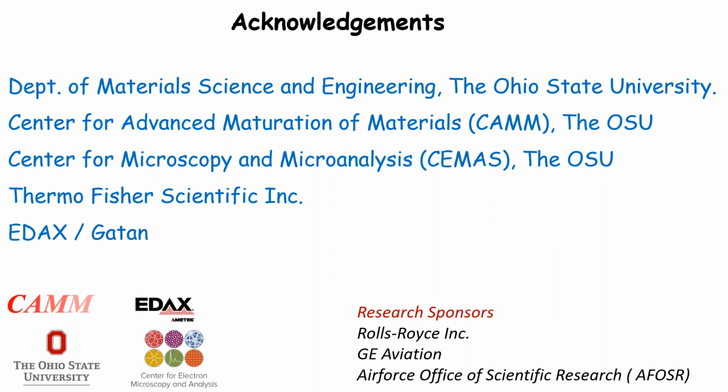If there is a contamination from the FIB, which is a gallium source in this case, you could always pick up some gallium. And with that, some oxygen could come with that too. So which is of less importance. It may be important to detect whether gallium or oxides are there, but it won't change the kinetics of at least the first part of the talk, where the oxygen kinetics are there.